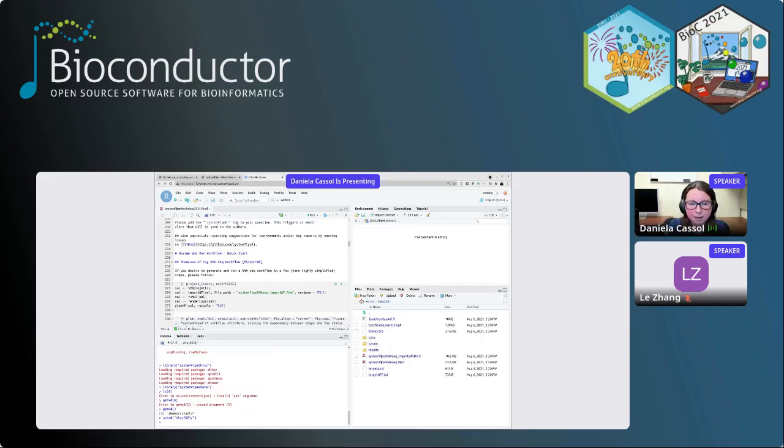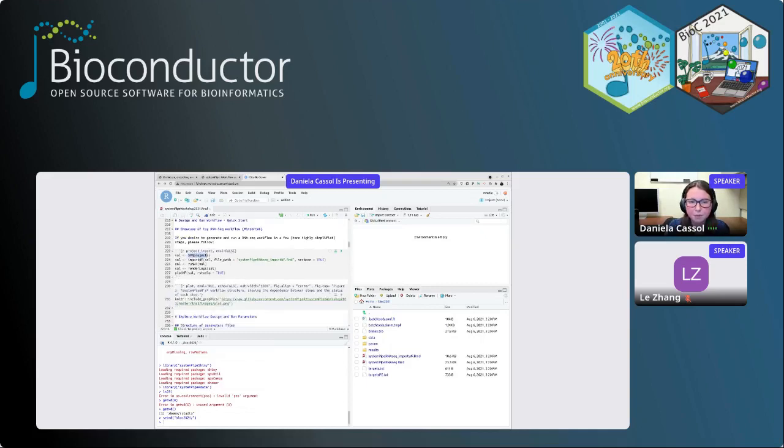So I am on line 223. And then here you see this function, which is called SPR project. What this function does is check this directory, check if everything we need is there, and then generate our workflow. And then we create an object called sal. Now I'll check this object. You can see here it is an instance of the SYSargsList. This is an S4 class I mentioned.